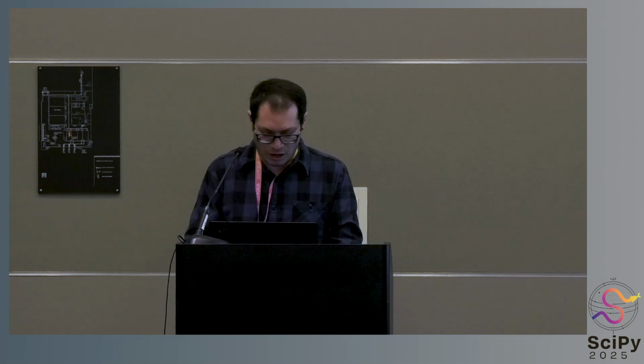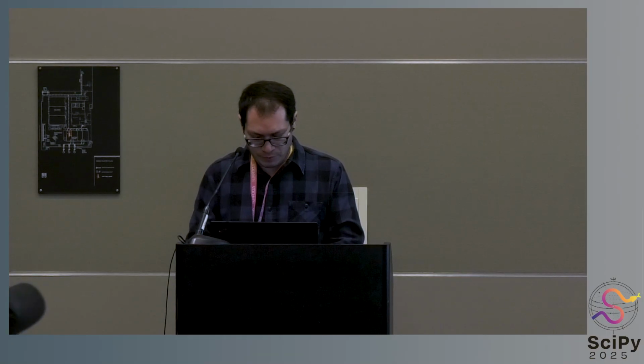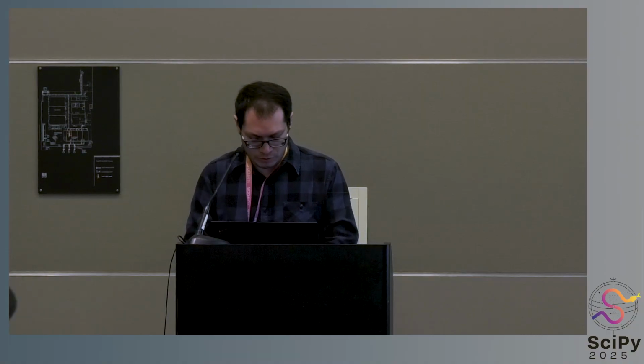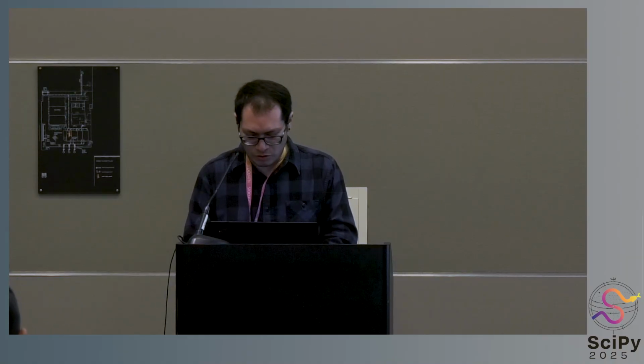So what we are going to do is call the to_zarr method from our labels Dask array. We need to give the path where we want to store the output. I'm going to call it cmu1 crop labels, suppose Cyto3, giving a meaningful name so we know what we applied to generate that image. And then we want to store this in the component 0. So this is the segmentation on the full resolution image. We can pass arguments that go directly to the zarr function that creates the file.